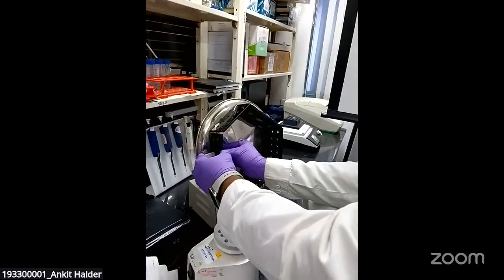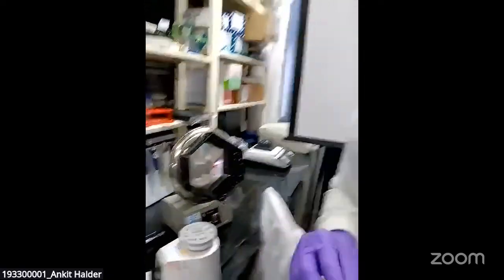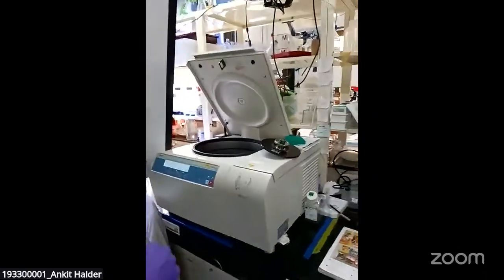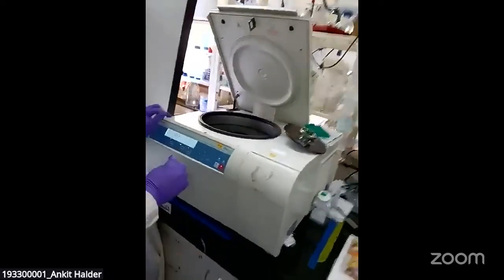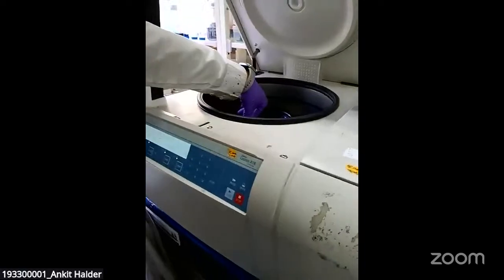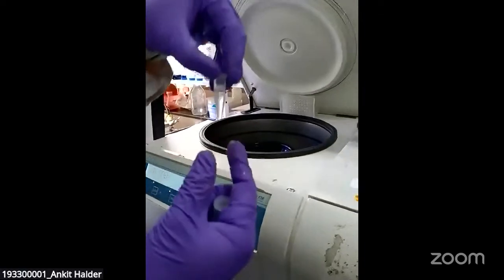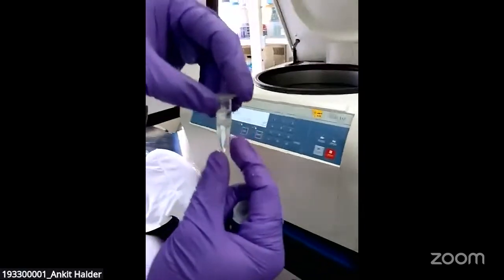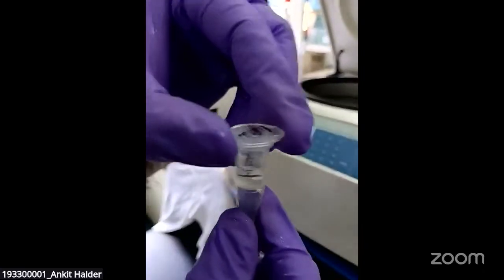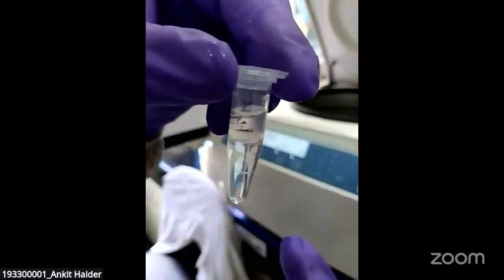Okay, so I have already done the protocols. I have already performed the vortex, added the water, and I have also centrifuged it at 4,000 for 10 minutes at room temperature for the lipidomics protocol. After running it in the centrifuge, you can see three different distinct layers coming. I think you can see these three distinct layers are there.